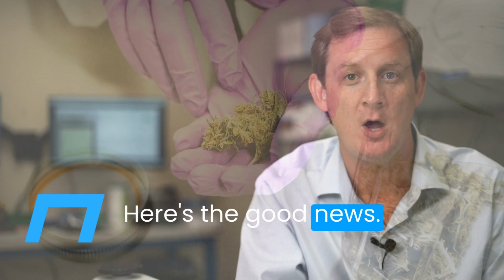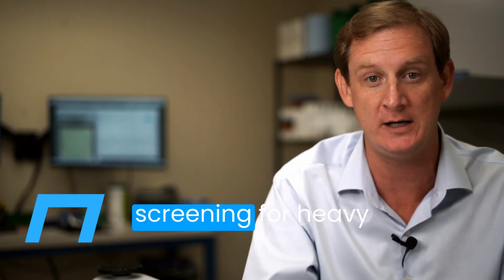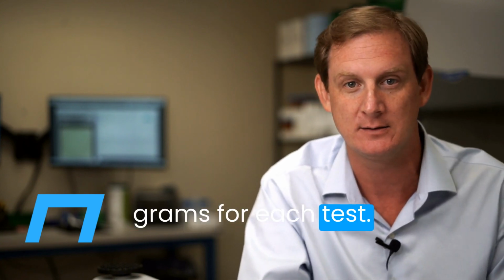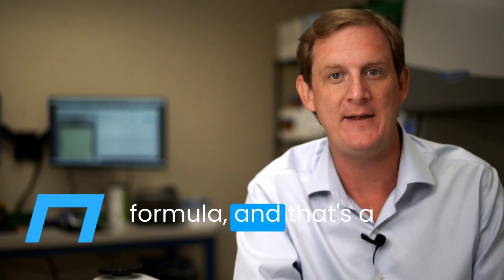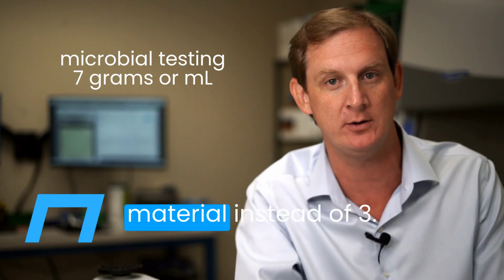Here's the good news. For most every other test you order, like a terpene profile or a screening for heavy metals, you simply add 3 more grams for each test. Now there is one exception to this formula, and that's a screening for mold and microbials, which requires 7 grams of material instead of 3.